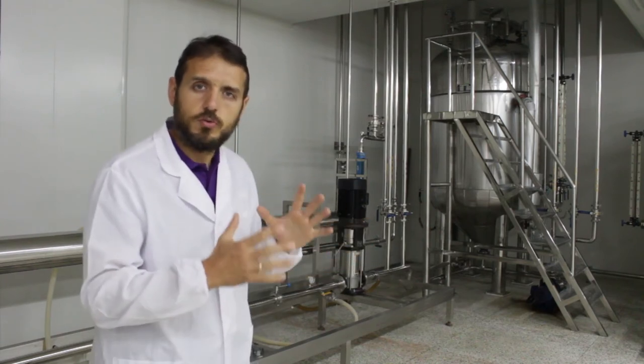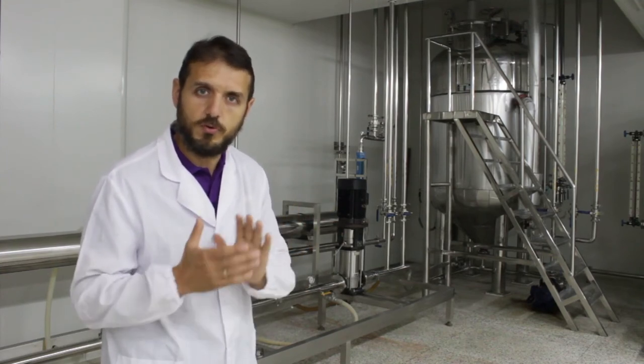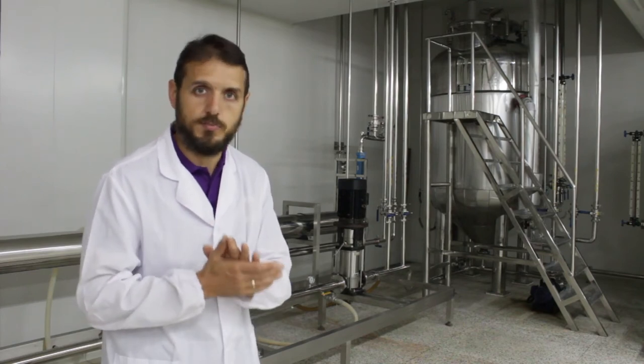This is a crucial part of the entire process, which makes sure that our solution, before it goes for spray drying, is as clean as possible.